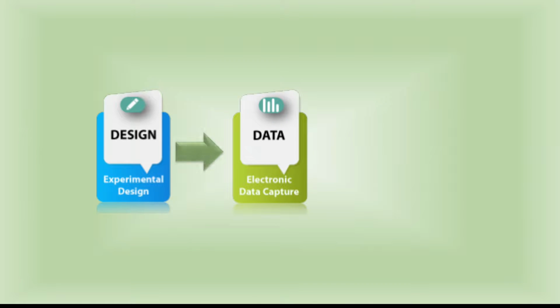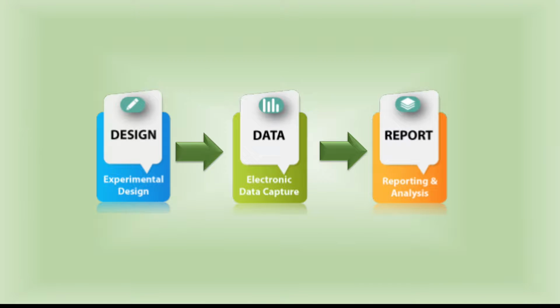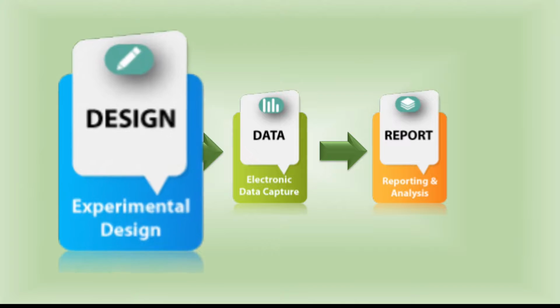Seralogix helps researchers at each step of the preclinical study process to avoid the errors and the small mistakes that can render study results invalid, so that the researcher's ideas and hypotheses can be fully realized with significantly higher rates of reproducibility and ultimately greater positive impact on the problem to be solved. To understand how it works, let's start by looking at how Seralogix supports study experimental design.